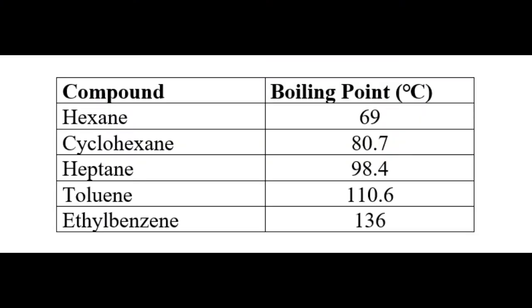Hello, chemistry students. Today we will be performing our distillation experiment. In this experiment, we will use distillation to separate a mixture of two volatile liquids with different boiling points. Our unknown mixture will consist of two of the liquids from the following table.